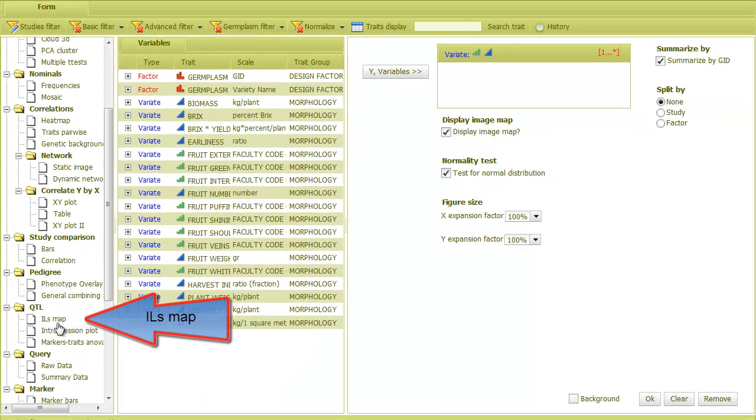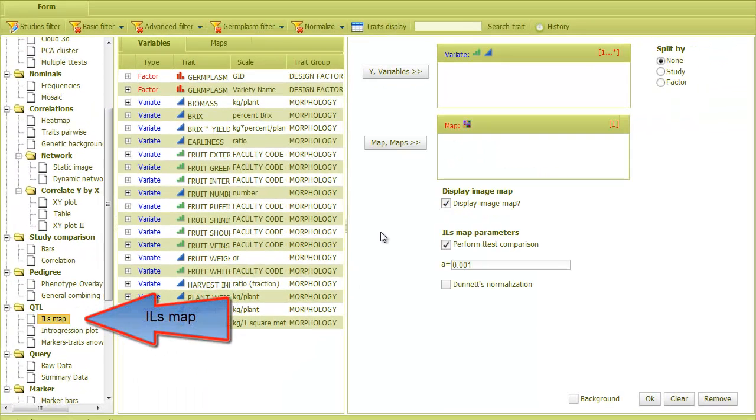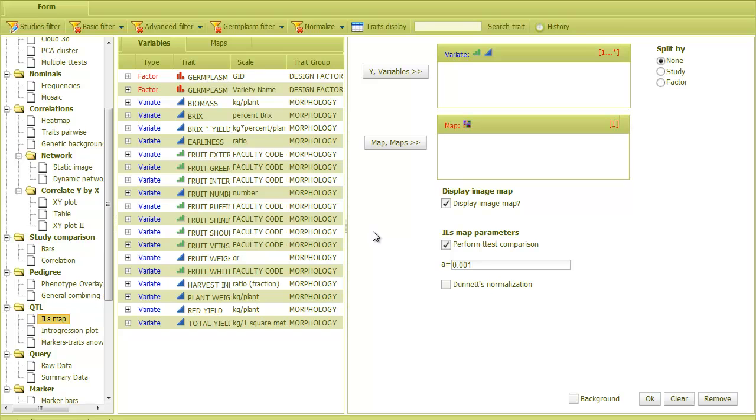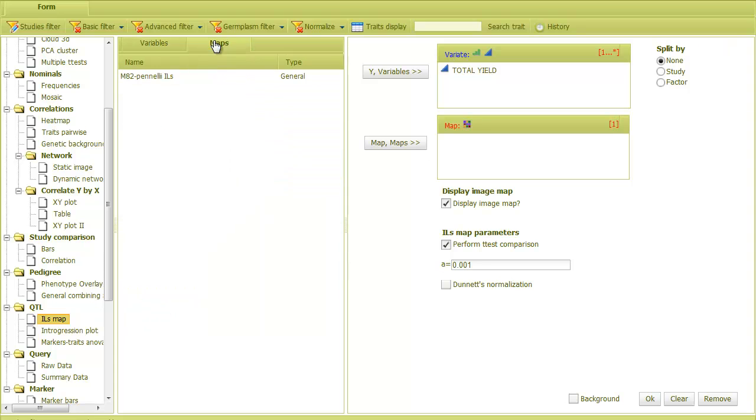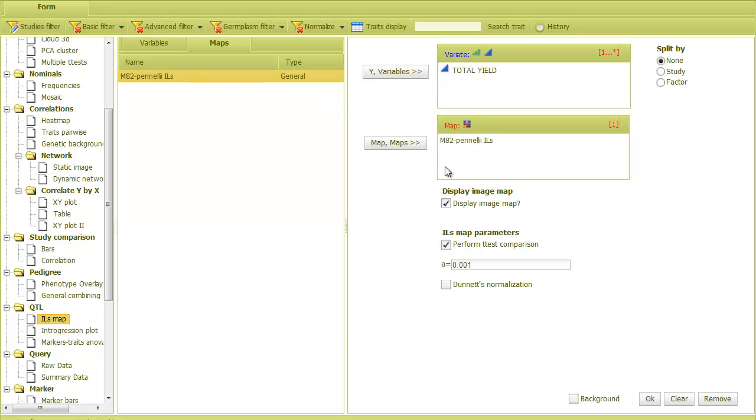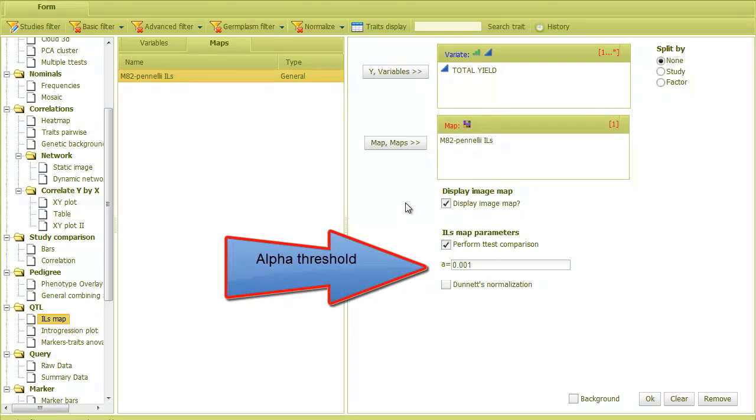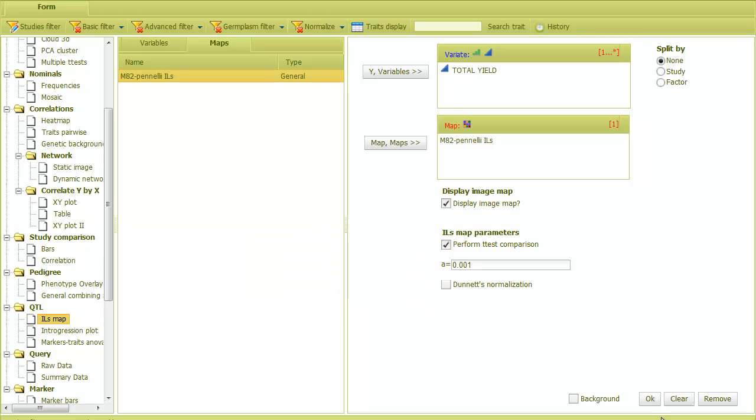Now, I'll select the ILs map analysis. Then, I'll put the trait that I want to map into the Y field. Let's take total yield. Next, I go to the Maps tab. This tab presents genetic maps that are available for this population. I'll select this map and put it in the field. Then, I can set the alpha level of the statistical comparison, or leave it as it is, and then click OK.